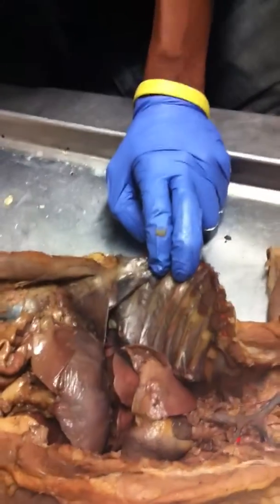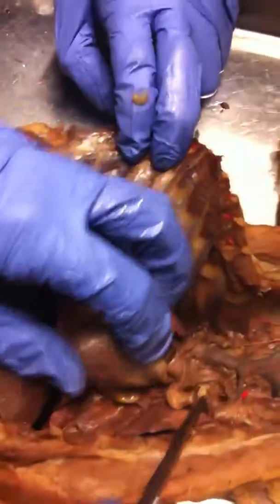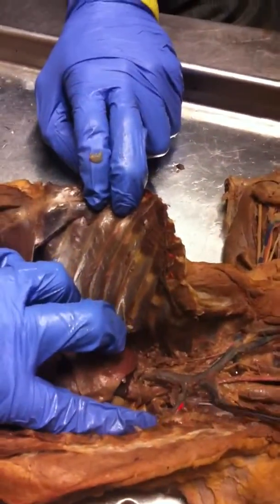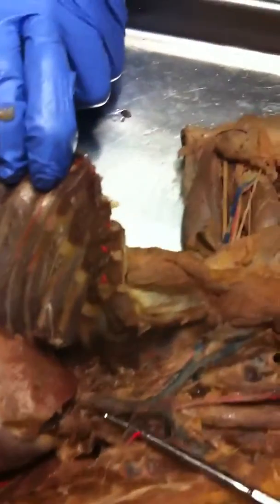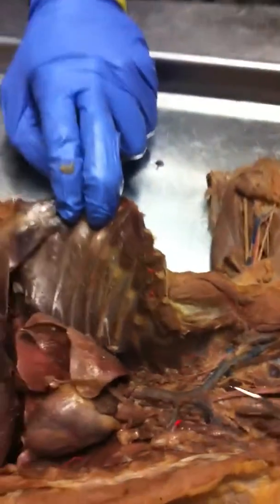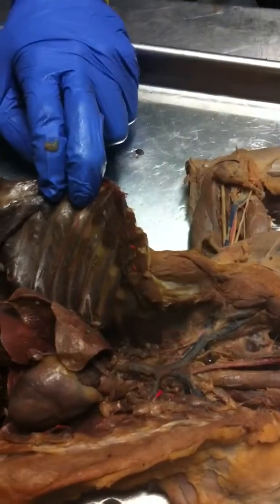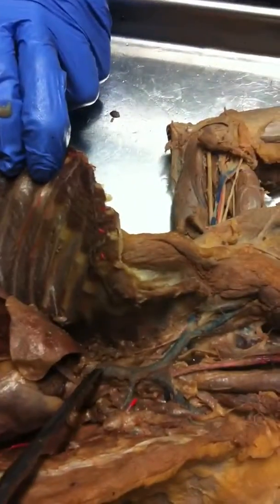Okay. Azygos vein, we didn't find that one, right? We couldn't see the other one. Well, let's say, do you think that would be running on the inside of the rear? Kind of looks like it. That looks like that could be it. Let's go with that. This is the azygos vein, because the 2 big branches are definitely the brachiocephalic. So that would be the azygos. Show me superior vena cava again. Right here. Superior vena cava.